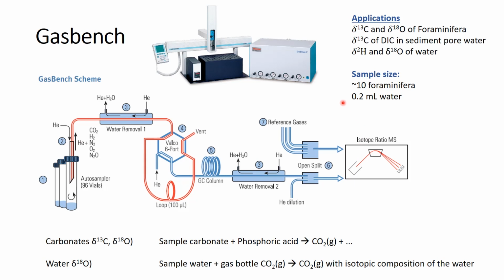Sample sizes required can be around 10 forams, but it differs, of course, depending on the size of the forams, and about 0.2 milliliters of water.